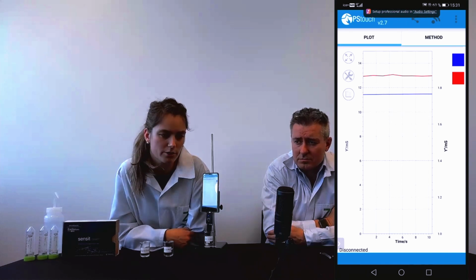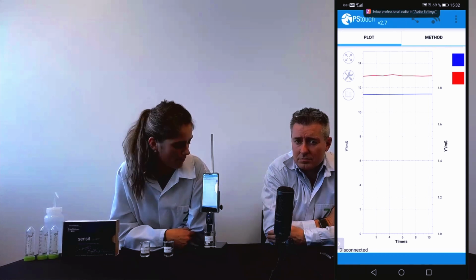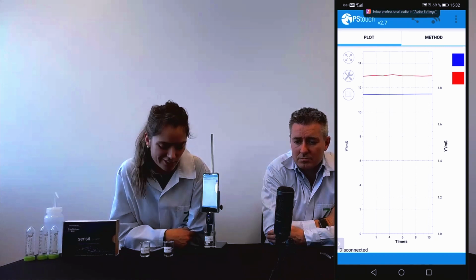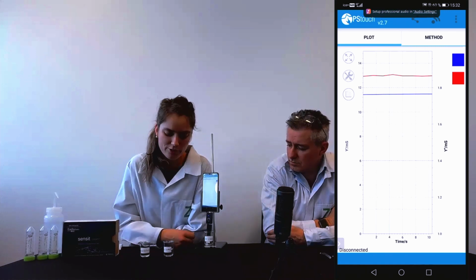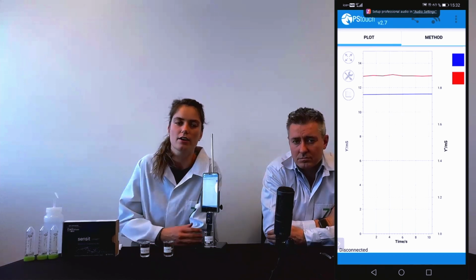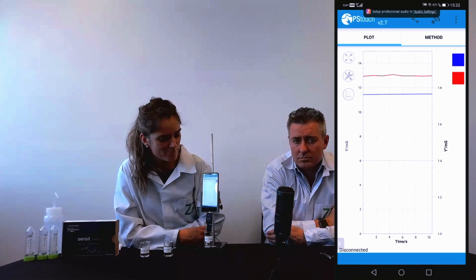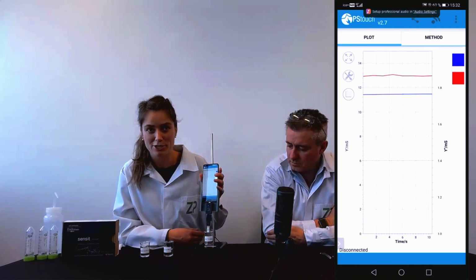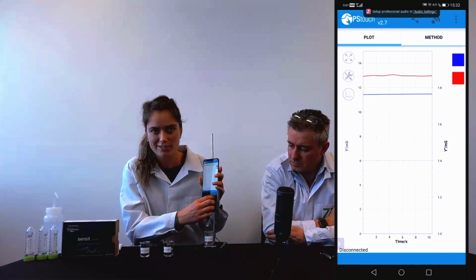And then multiplying it by 0.5, you get the conductivity, which this time will be approximately 6,000 microsiemens per centimeter, which is the conductance. And that was bigger than the other two solutions, which had a smaller concentration. So that's it for the salinity measurements. And so it's quite fast to do.